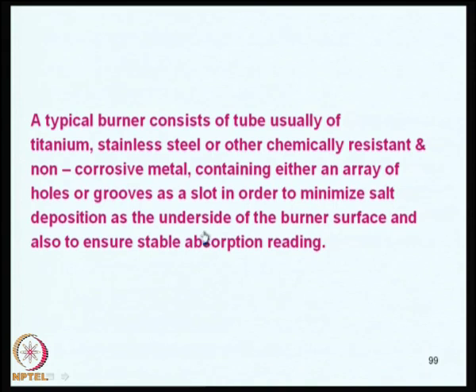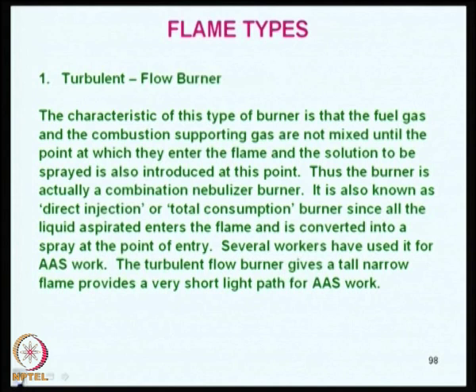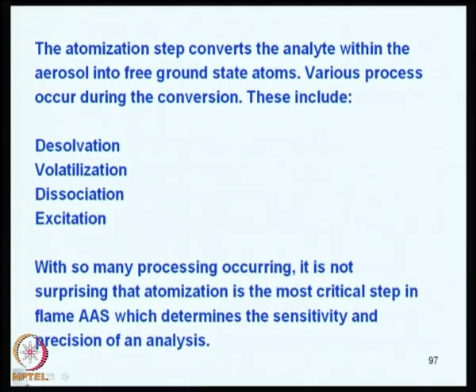A lot of requirements are there, and we will discuss these flames a little more, and then we will move on to other aspects of atomic absorption measurement.